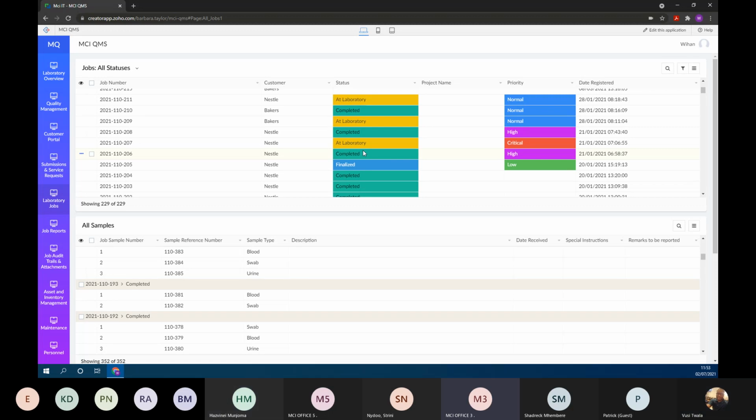So I think the best way to answer that would be to understand that in a laboratory you can have a batch of 1,000 tests with a certain deadline. If you miss the deadline with one result, that is what you are remembered for, because in a lot of cases, until the final report is issued, it's not final, unfortunately, in the case of laboratories. So the critical point is to ensure that the progress and the status of each test individually is managed in an automated manner as far as possible, to reduce the probability that something can be missed.